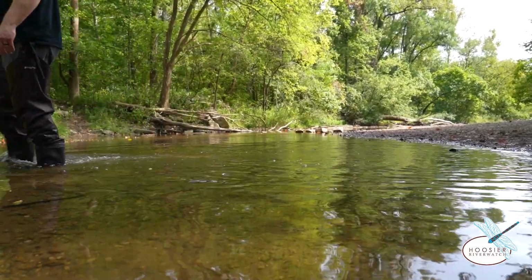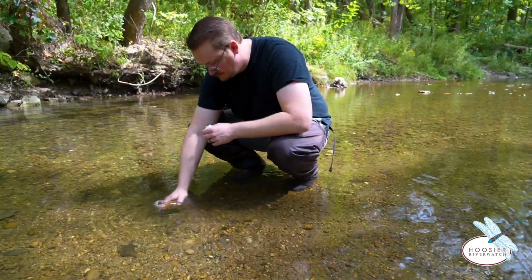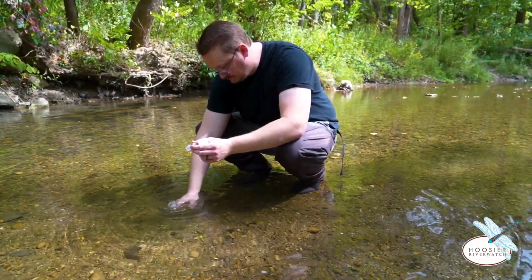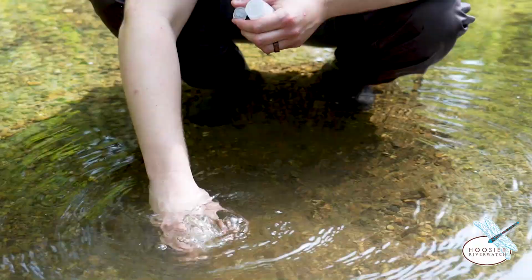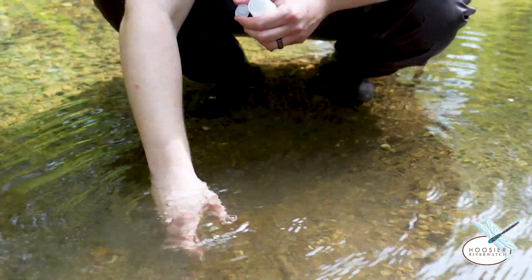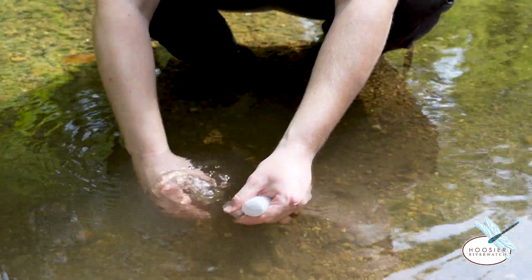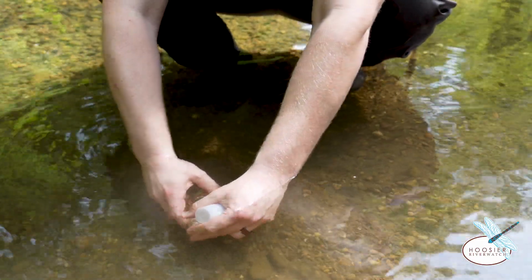To collect a BOD sample, first submerge a bottle below the water surface for 3 to 5 inches. Remember to sample upstream in the main flow. Allow water to flow into the bottle for about 2 minutes, ensuring no air bubbles are present. Replace the stopper while the bottle is underwater and remove it from the stream.